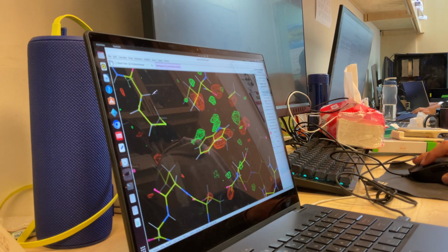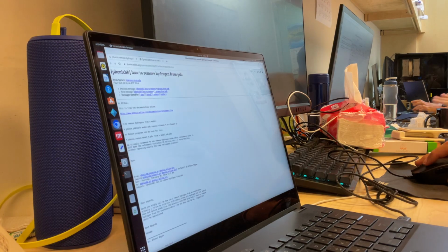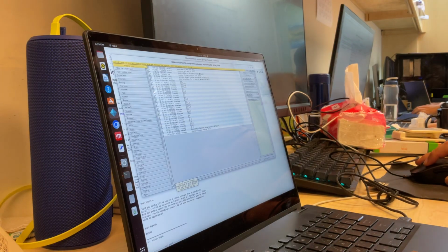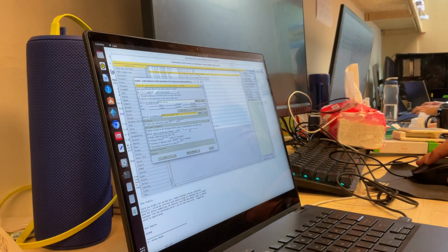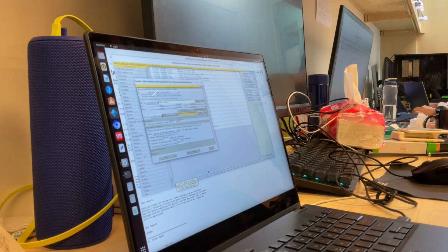And if you want to do extrapolation, the extrapolation can be done now with the structure factors that you just generated in Scale It. So this file here contains all of the data that you need to extrapolate and to start producing the extrapolated structure factors and start refining for the 180 picosecond structure.